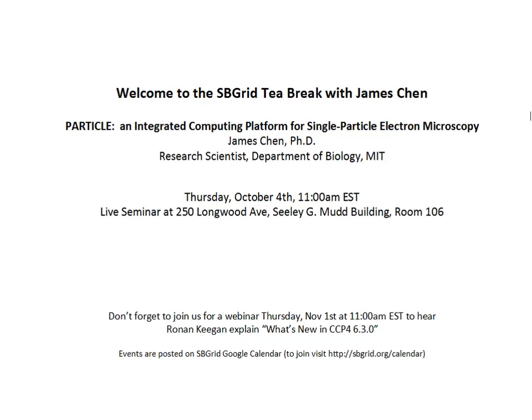So for practical matters, I think the program has been tested. Yes. Of course, for graphics card, there are also different vendors, and if you need, I can send you the specific model. I need to check, look it up. Yes, it's a Quadro model.